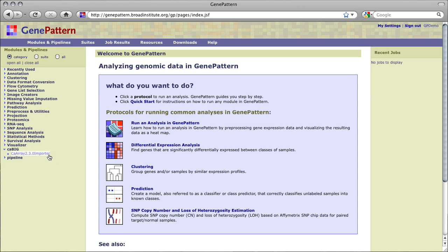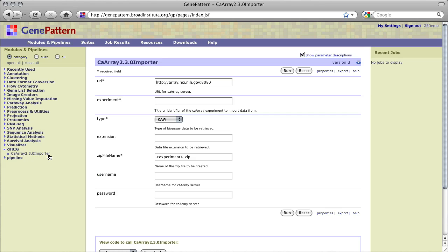CA Array is an open source array data management system which guides the annotation and exchange of array data across the Cancer Biomedical Informatics Grid, or CABIG. More information about CA Array and CABIG can be found at cabig.cancer.gov.